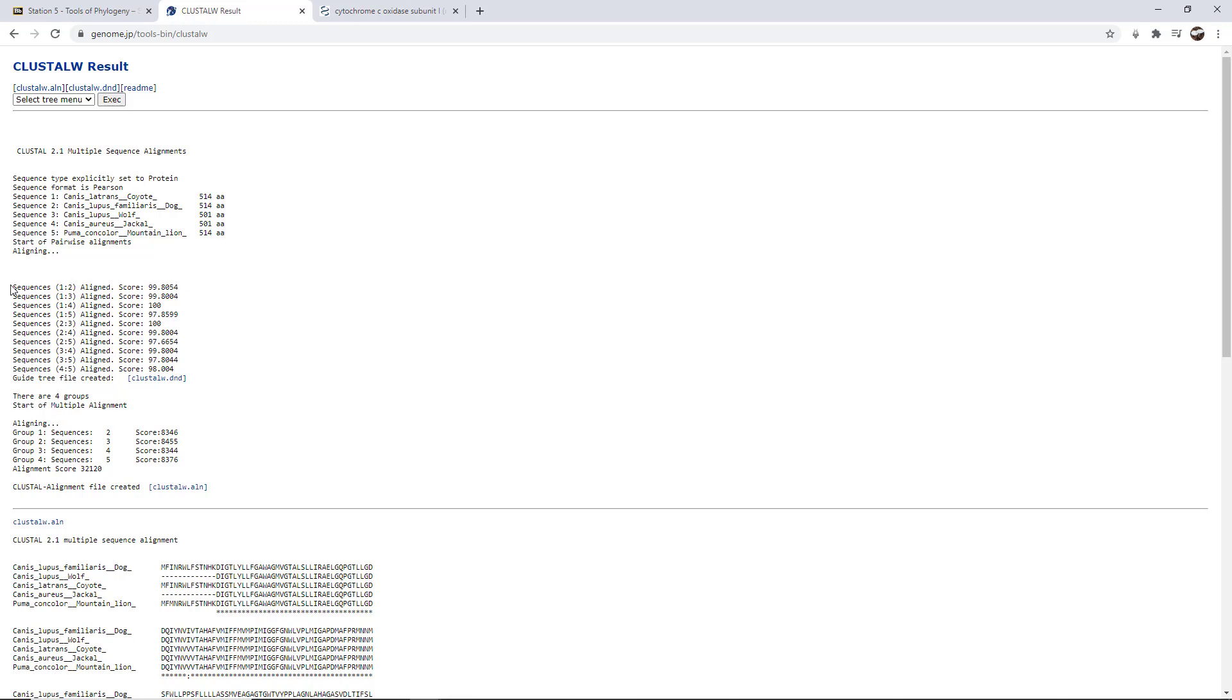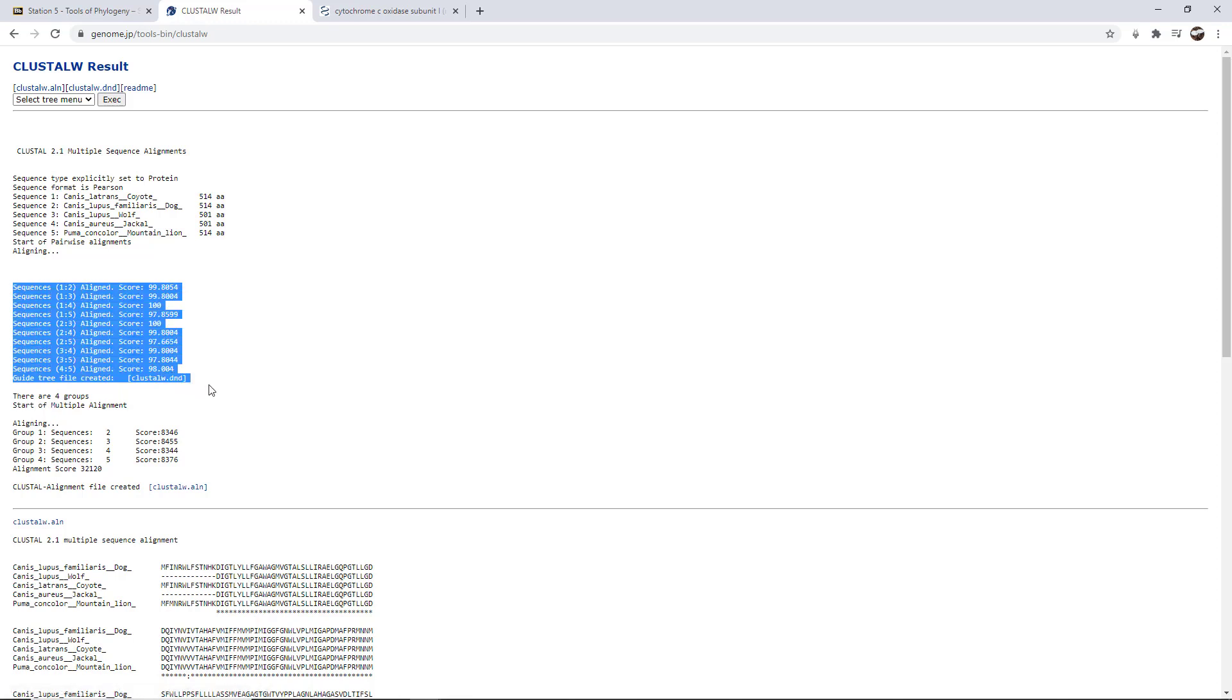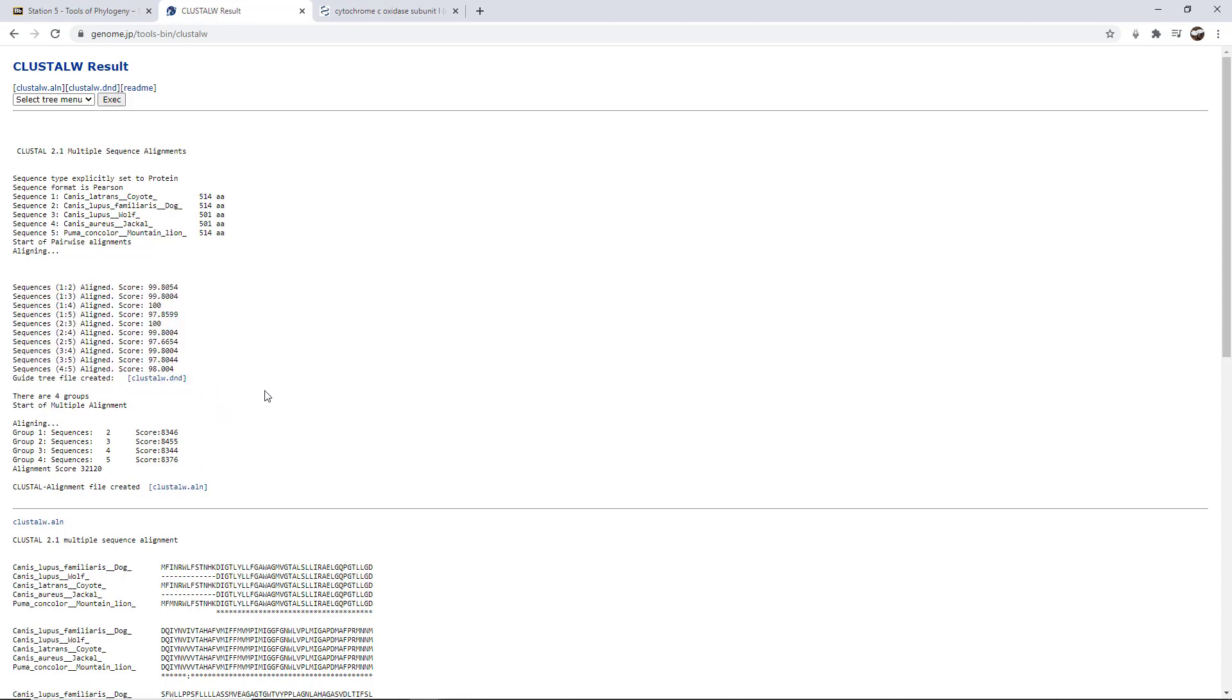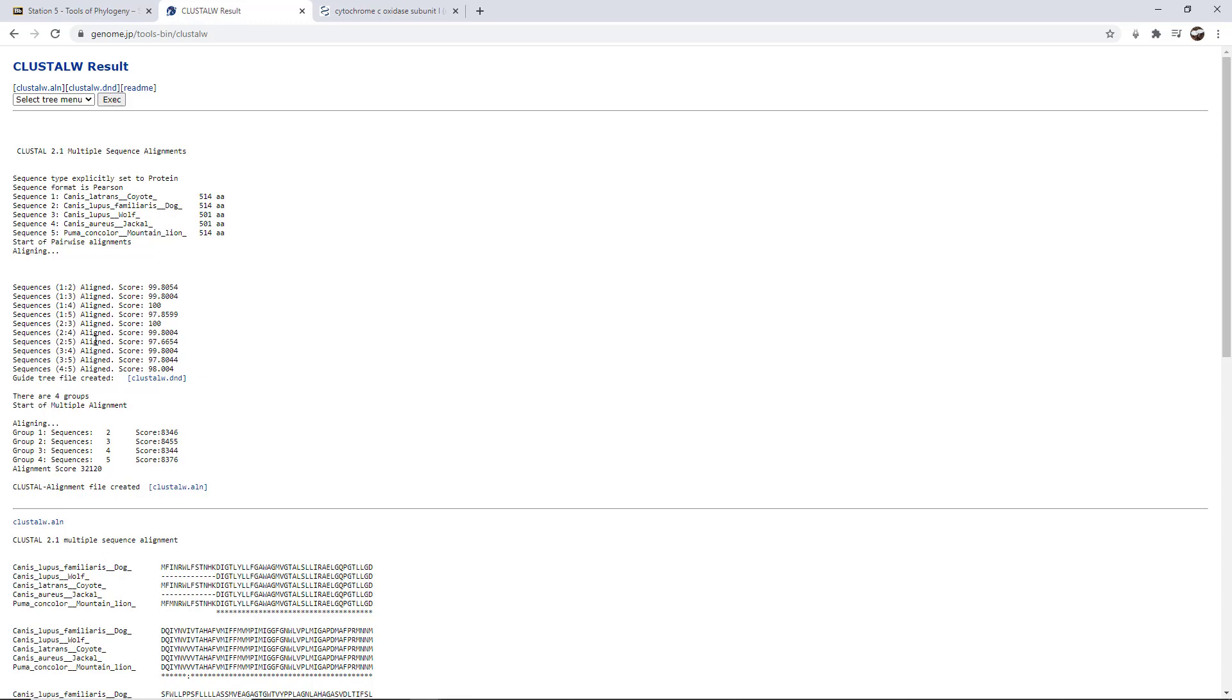Another really important piece is this distance matrix here. What it did was it calculated the similarity between sequences. It compared sequence 1 to 2, 1 to 3, 1 to 4, 1 to 5, 2 to 3, 2 to 4, 2 to 5, and so on. It basically compared each sequence to the next. And you'll see, for instance, the comparison between sequence 1 and 4 is 100% similarity. And between 2 and 3 is 100% similarity as well.